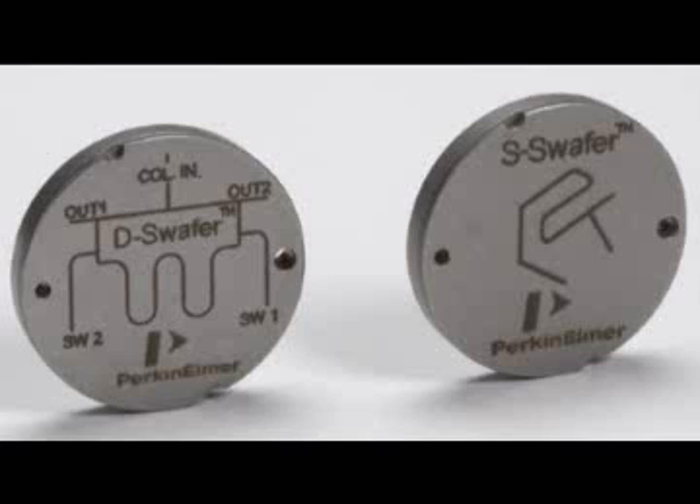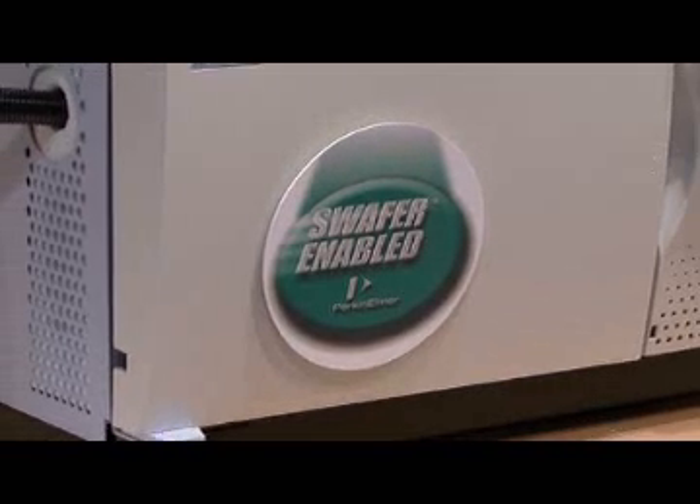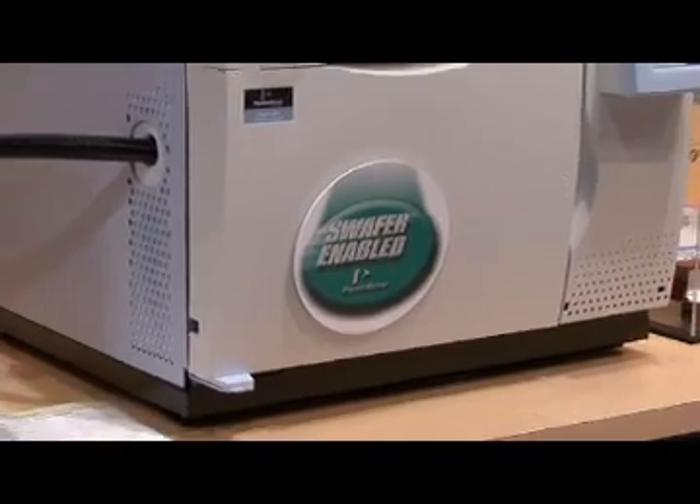We're also releasing the S wafer. The S stands for splitting. With this new technology, we can go up to four different detectors on one injection. We have one injection in the injector, we hit the S wafer, and we can split equally up to four different detectors.